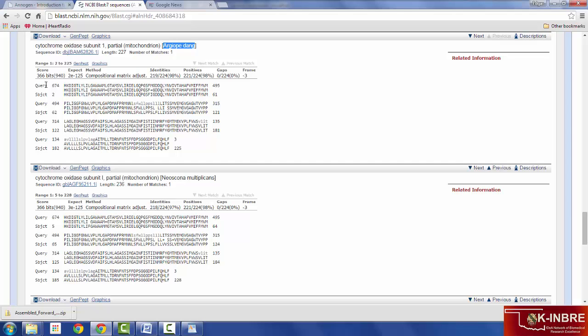An additional thing I'd like to highlight are some of the scores here. This here, -3, tells us that the DNA sequence was translated using the reverse complement of the query sequence that we provided, by giving it the negative sign. And then, starting with there were 0 gaps in our alignment, 221 positives. This is the total number of identical matches and the conservative substitutions, those 2 plus signs there. Here's the expectation value and the alignment score.